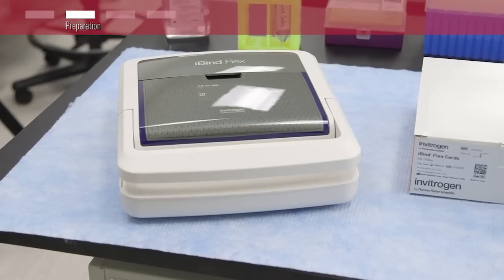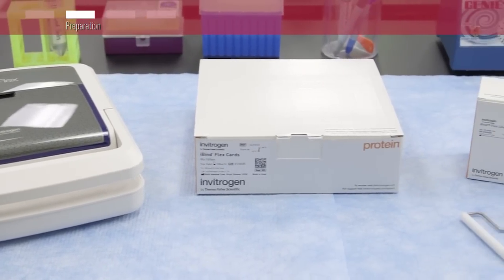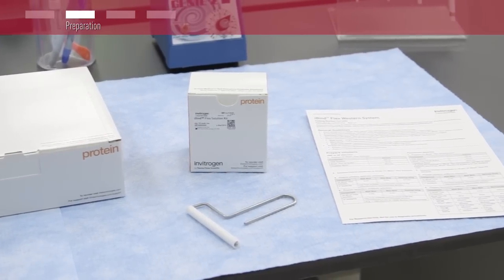In order to process your Western blots, make sure you have an iBind Flex device, an iBind Flex card, the iBind Flex solution kit, the roller, and the quick reference card.